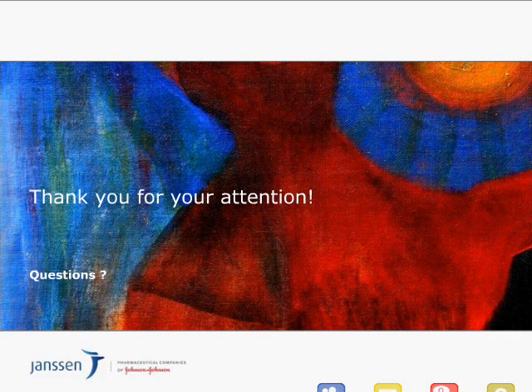No, currently we don't, but we have a special version we call Screen Designer. It works like a plug-in in Library Studio, so it's very specific for our screening work. In that software, we can generate combinations. Normally it's a full factorial design, and we transfer all the tags and chemicals you need into Library Studio. Okay, thanks.